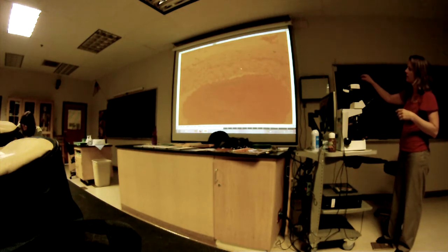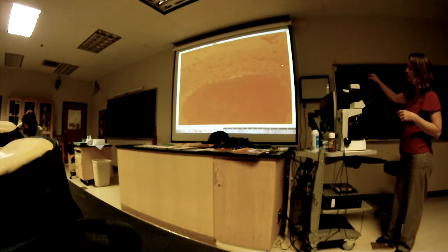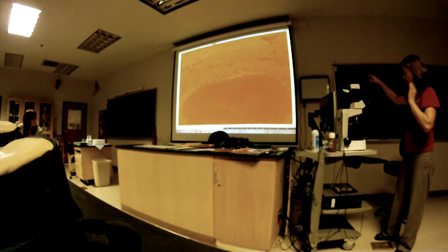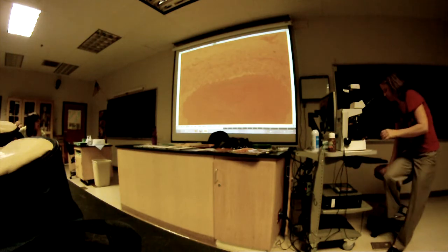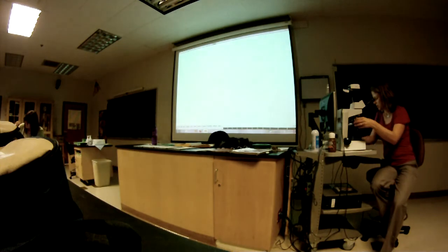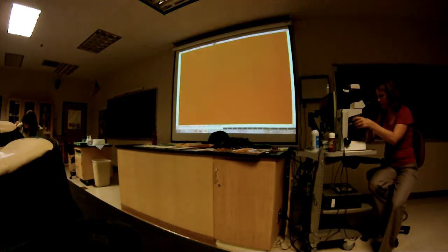Okay, so then the tunica media is this layer. And this is the, what's this one? Adventitia, yeah. I'm going to put up that other slide, which I think is a little better. Hopefully.